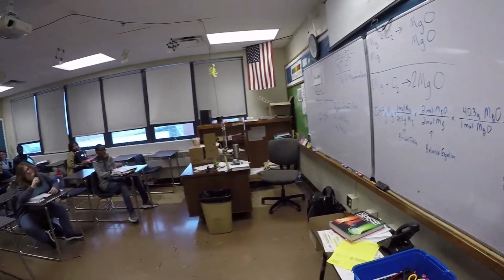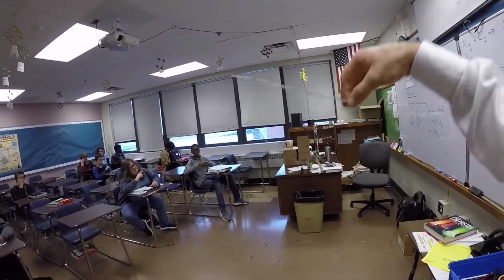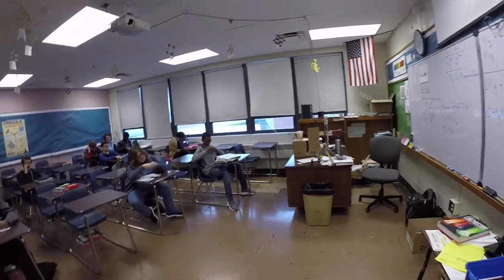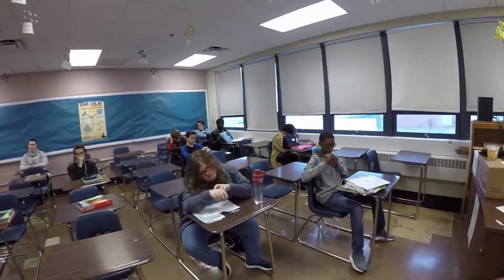This kind of freaks people out. I mean, the ash is going to weigh more? How's that possible? Because the oxygen sticks to it and it stays in the crucible. So the ash is predicted to weigh more. Now that's the goal. I want you to do that. See if you can see that. When you've got that, show me and I'll give you a little check mark on your paper.